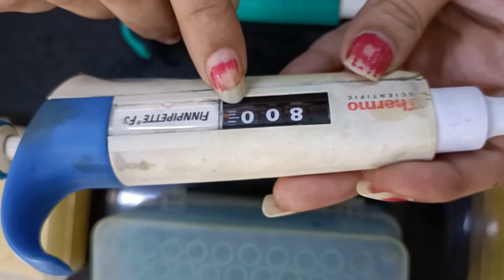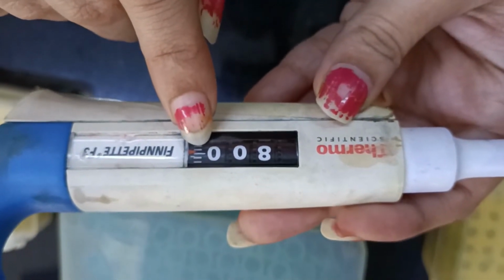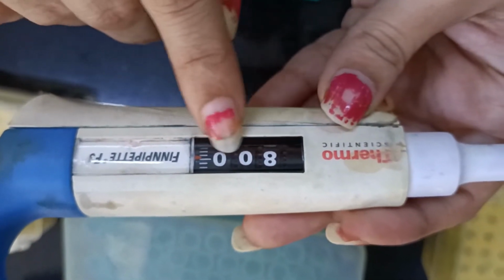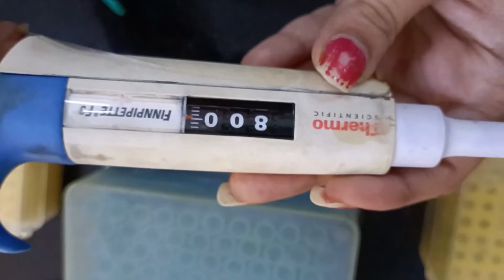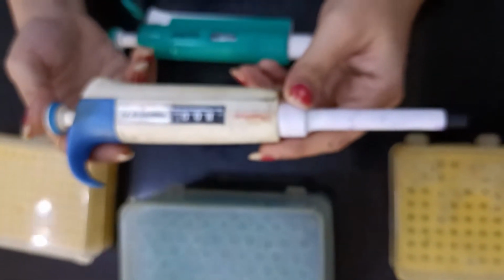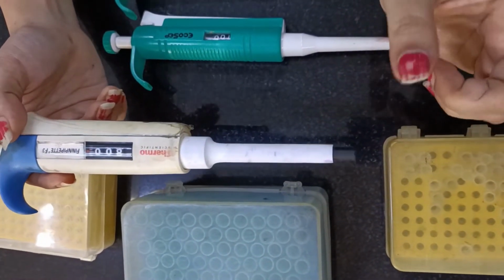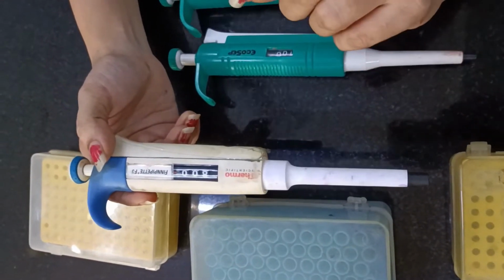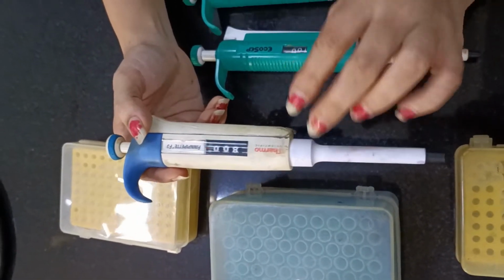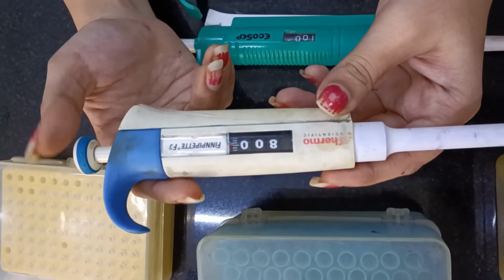Make a note that this red mark pointer is always with respect to the particular marking of a precise volume. Now the micropipette has been set at 800 microliter, so I could withdraw exactly 800 microliter with the micropipette. Now how exactly will the withdrawing be carried out?